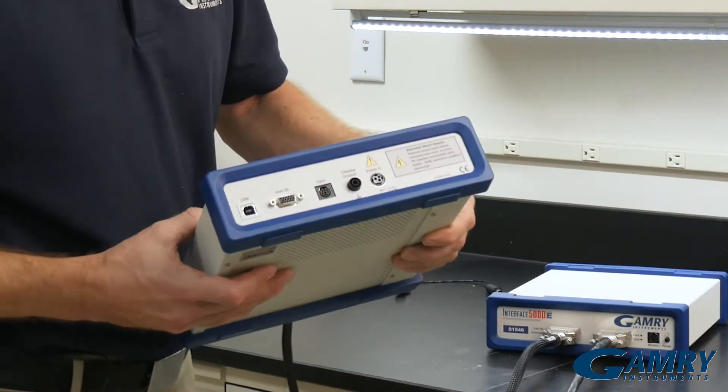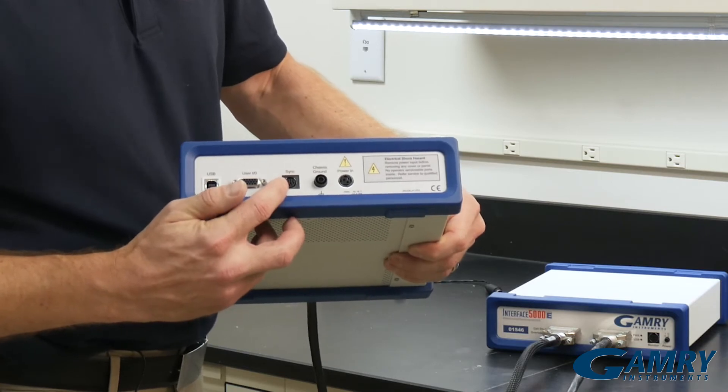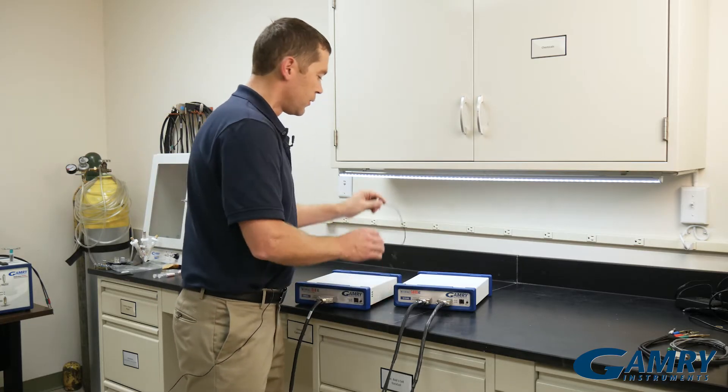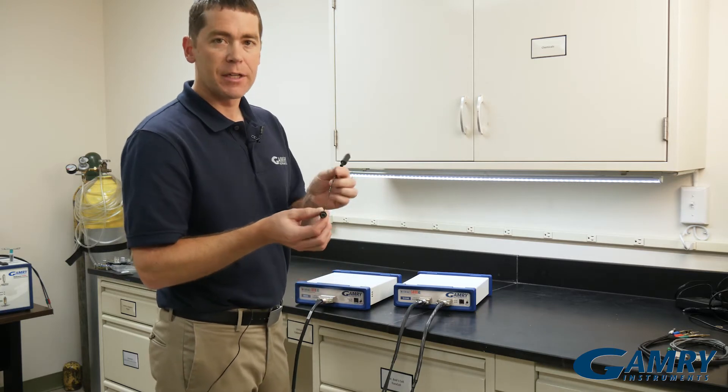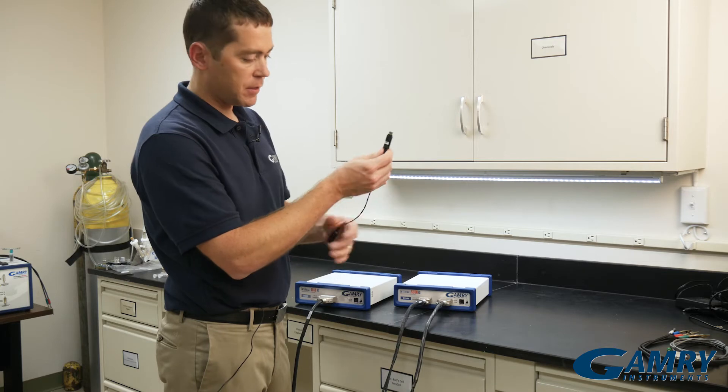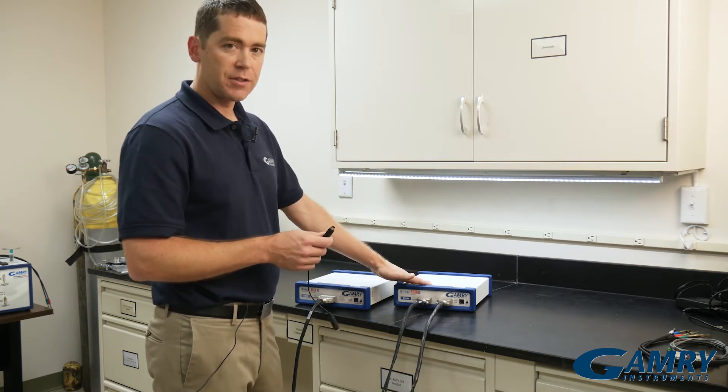On the back of our potentiostats, you'll see this sync port. Both instruments have these. You'll need a bipotentiostat synchronization cable. One end will say 'master' on it — that will go to the master potentiostat.